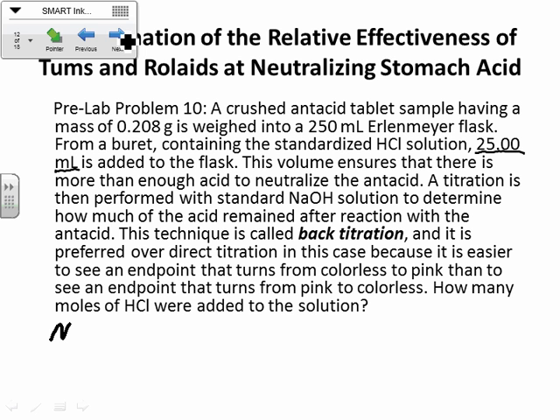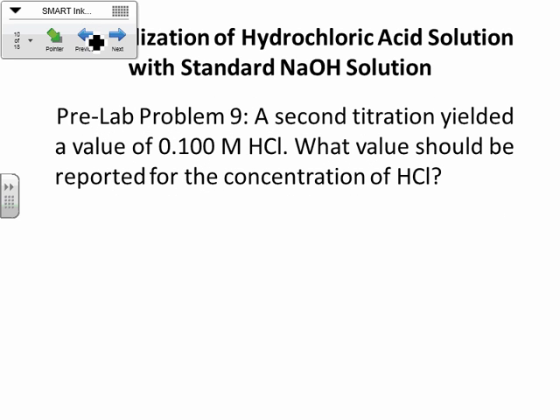All right. So molarity equals moles over liters. Molarity equals moles over liters. So we know the molarity of our HCl because we standardized it before, and I'm going to have to look back and remember exactly what it was.